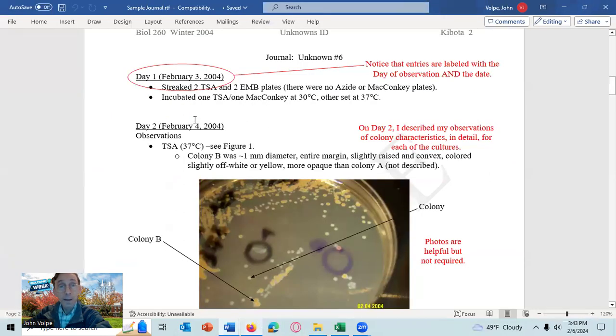And he got the 2 species of bacteria in a tube. That's the way we do it in the lab. On the online class, I'm just going to send out one number that's going to represent one species, but you can pretend that you're streaking it out for colony isolation and taking from an isolated colony and streaking it out a second time on another second dish, streaking it out for colony isolation and grabbing from a second colony so that your cells have gone through 2 colony formation events.